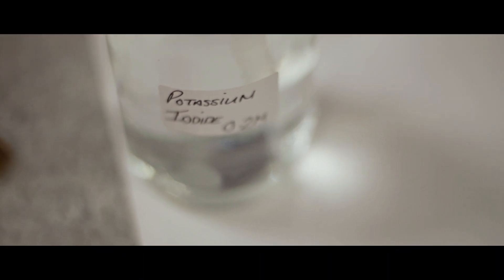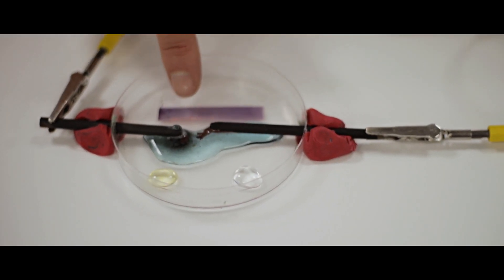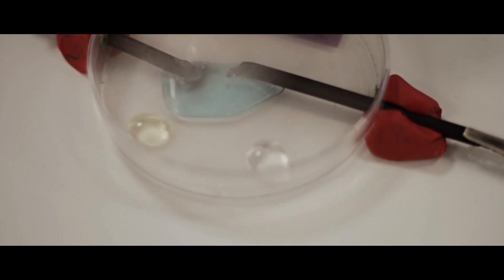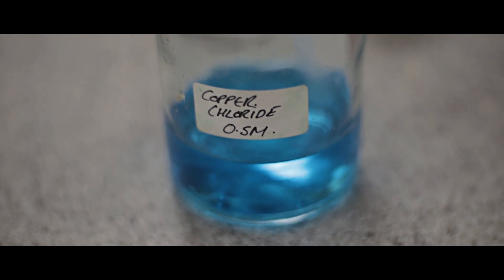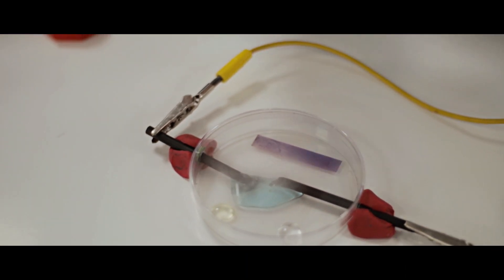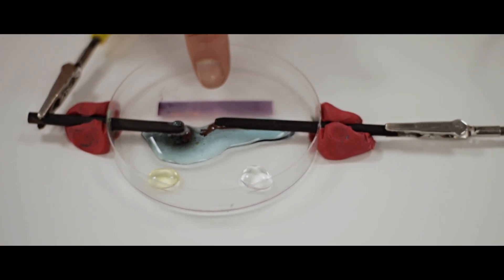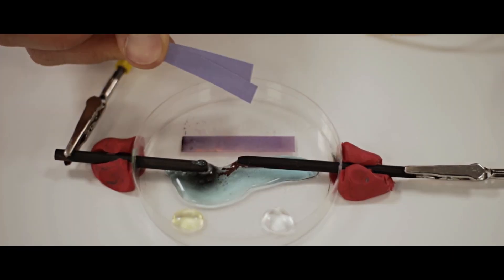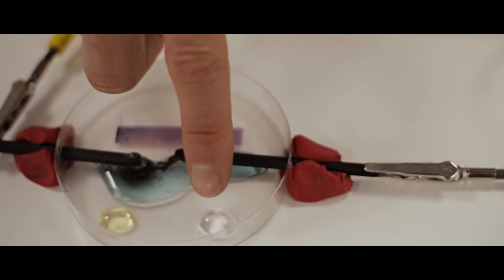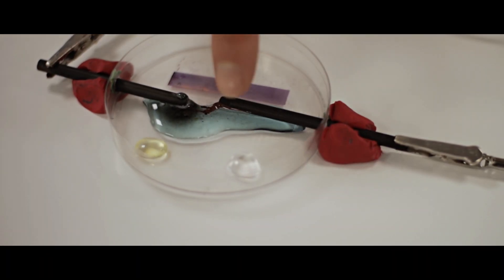The potassium iodide dot is starting to turn yellow, and that yellow indicates that iodine is being produced - the chlorine gas is displacing the iodine. We can see that the copper chloride solution started off as a nice blue colour and is now starting to decolourise as the copper ions are being removed. The blue litmus paper is starting to turn white - it's being bleached, and that's the chlorine gas doing that. The potassium iodide has been converted to iodine, and the potassium bromide is starting to react.